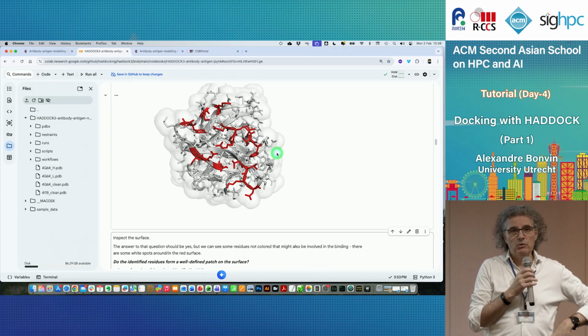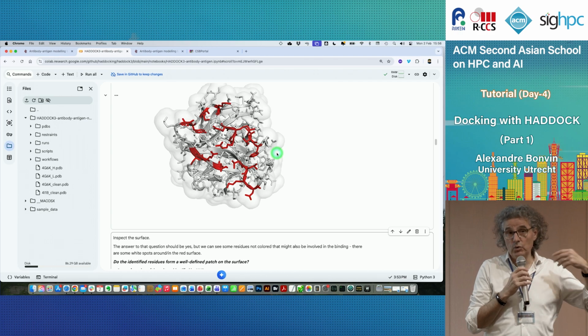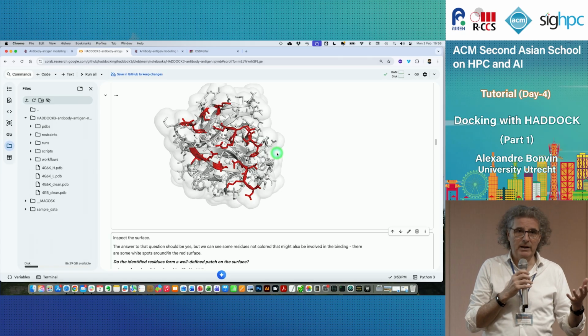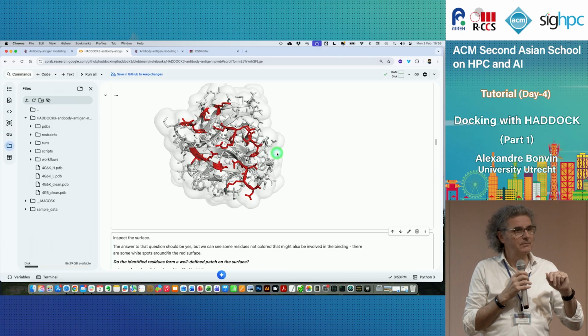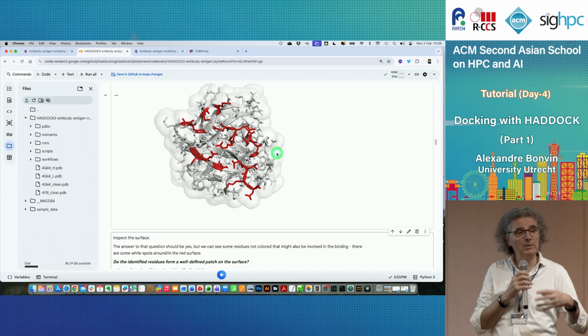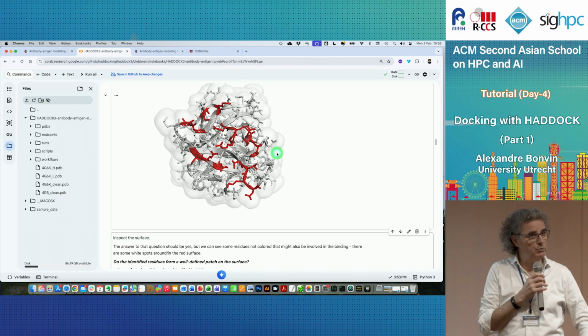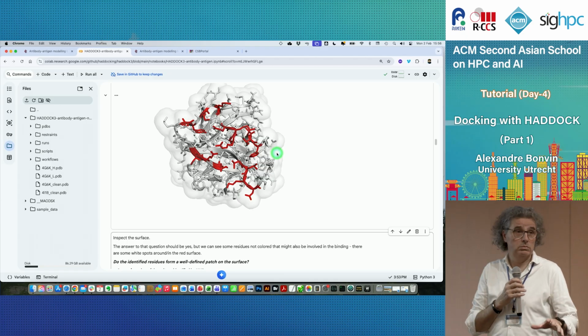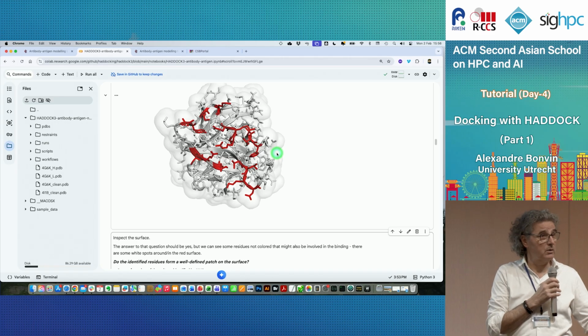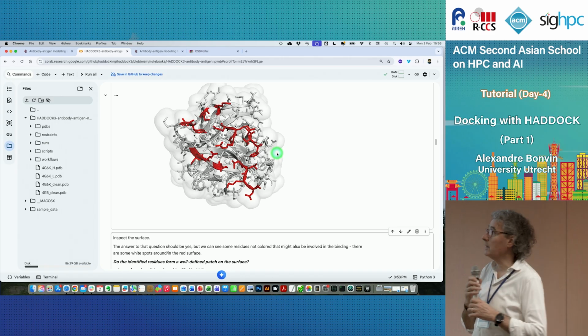So from time to time, you're going to remove good data, and you might get a wrong model. But from time to time, you might remove bad data, and you get a better model. That's the theory, basically. And then you hope that your scoring function will be able to distinguish between those. If you know that your data are fully reliable, you can turn this off. So that's a parameter in the setup of the docking. Okay.